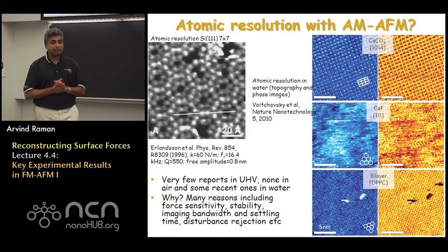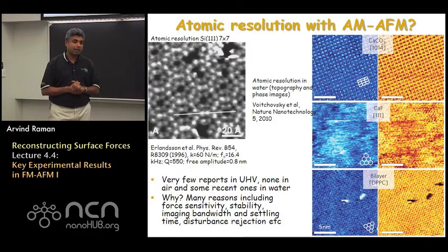Generally speaking, using tapping mode AFM for getting atomic resolution images has been a difficult task, and there are very few works in the literature that have been able to show atomic resolution images with tapping mode AFM, in comparison to the frequency modulated AFM approach, where there are hundreds of papers showing atomic resolution, true atomic resolution.